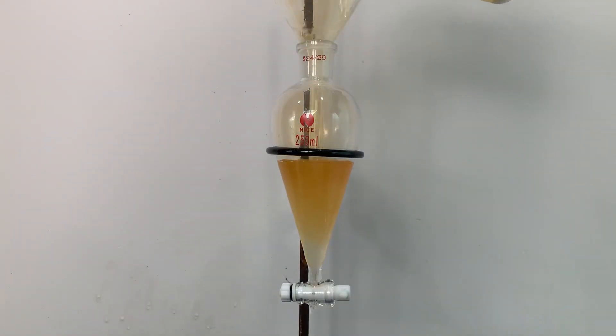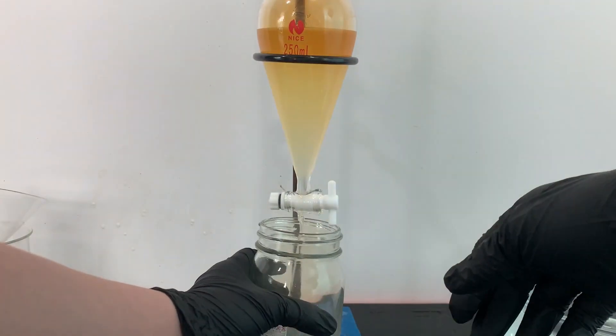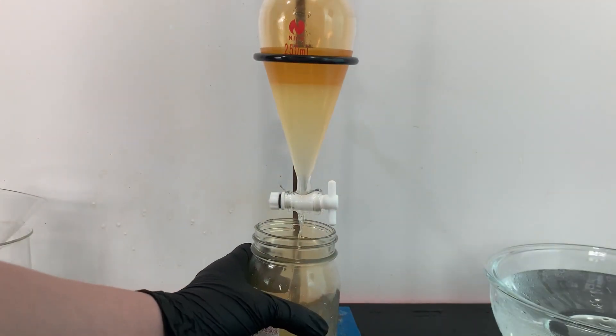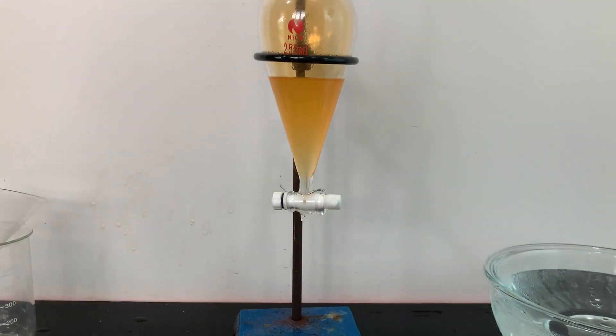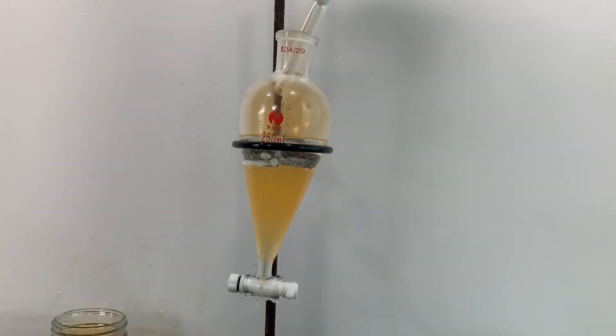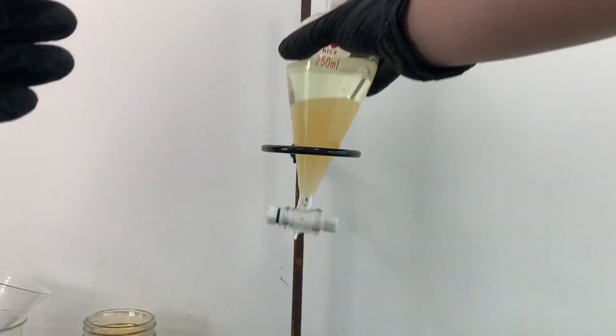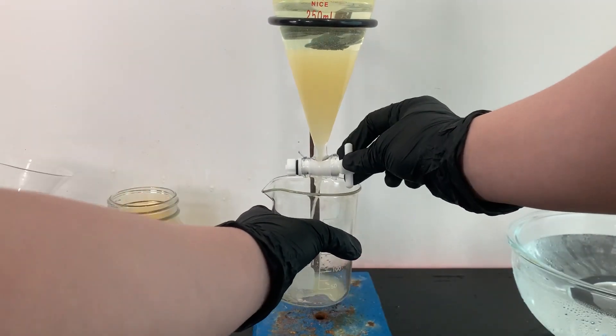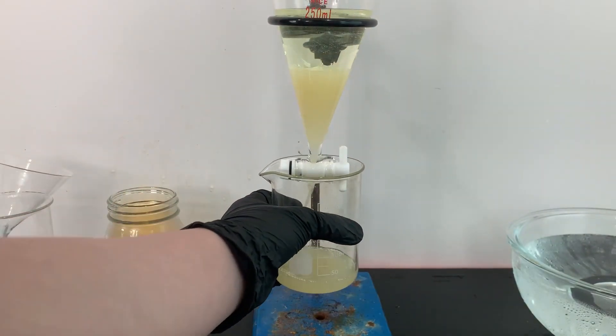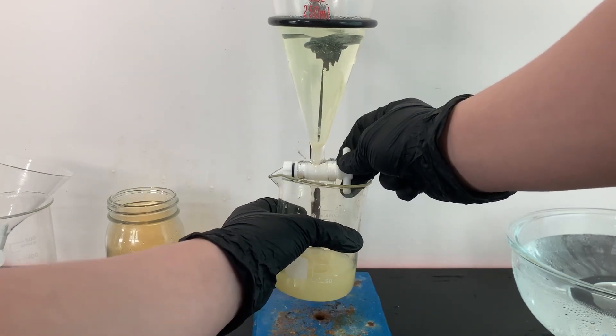The contents are transferred to a separatory funnel and the bottom layer is drained. The nitrobenzene was then washed with water. The funnel was shaken and vented. The bottom nitrobenzene layer was then drained into a beaker. The nitrobenzene was washed like this for 3 times.